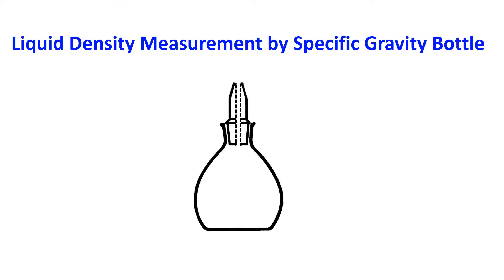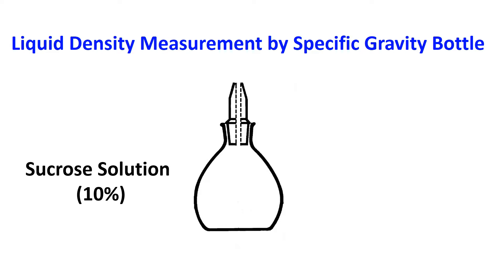Welcome to my new video. This video presents liquid density measurement by a specific gravity bottle. We consider a sucrose solution of 10% and we are going to measure the apparent density of the sucrose solution.